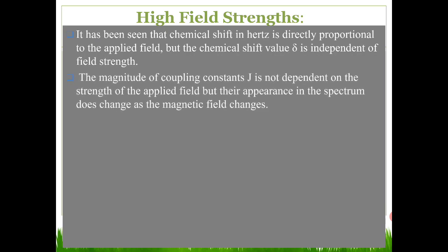And the magnitude of the coupling constant is independent of the strength of the applied field. So understand that the coupling constant will not change with respect to the magnetic field, whereas the separation of the chemical shift values increases when you increase the magnetic field.